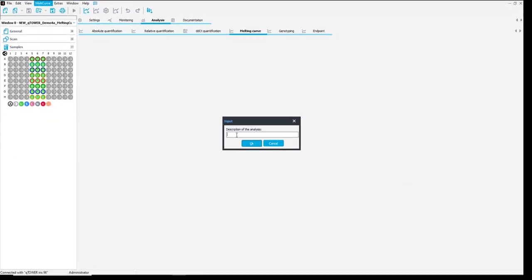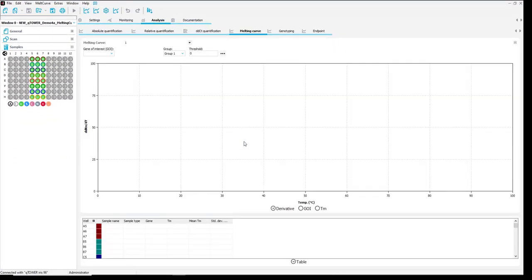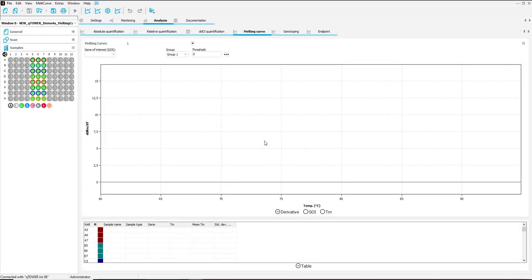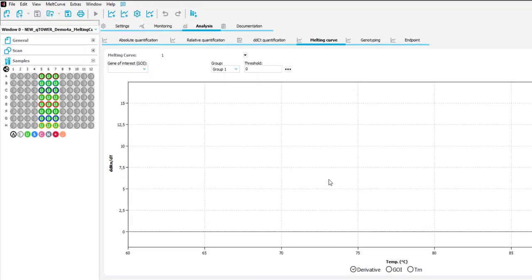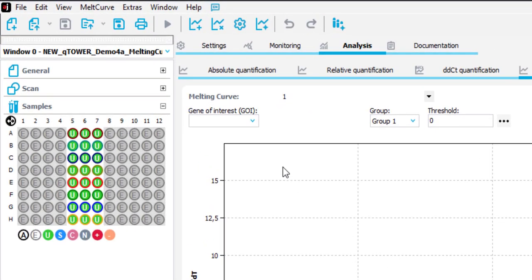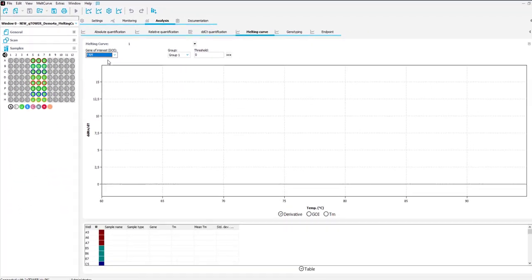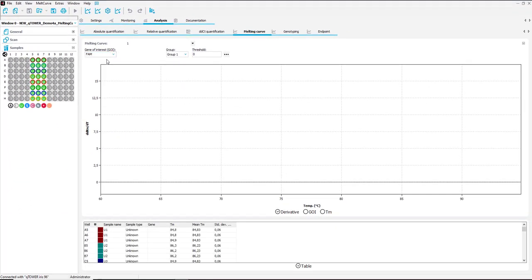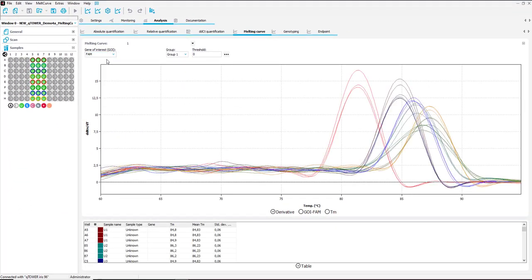Enter a name in the window. Select a gene of interest from the drop down menu and the results of the melting curve will appear.